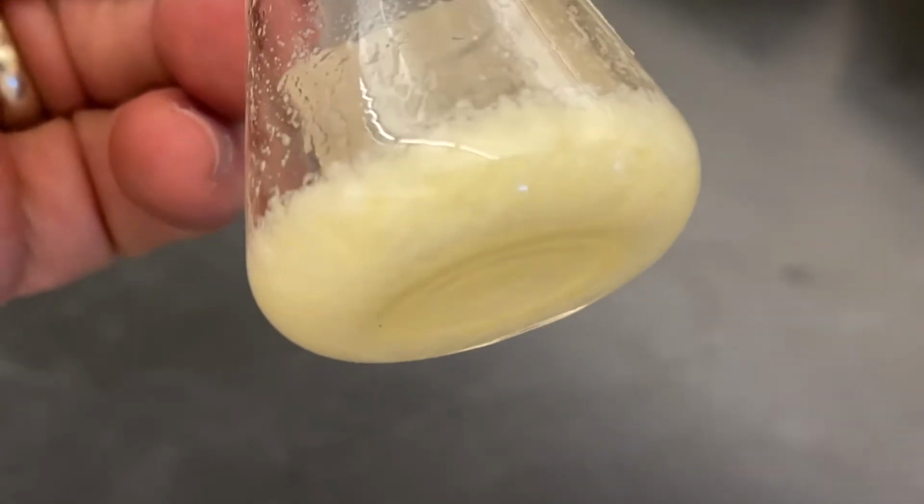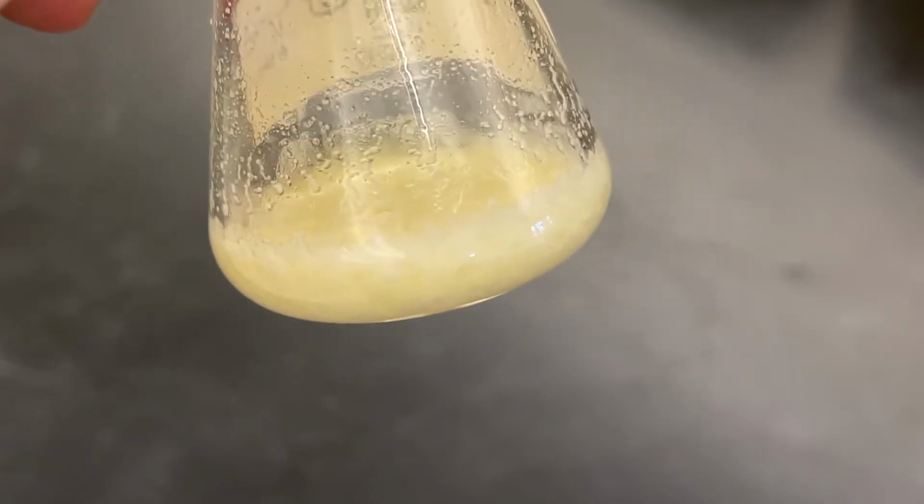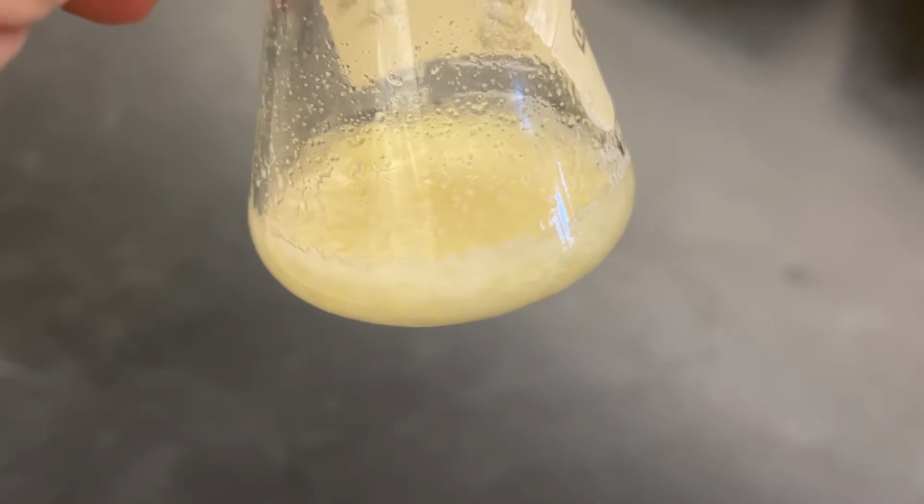It's a 2-day synthesis, and we can see that it's all solid. The idea now is to ice it down and then set up a filtration apparatus, and we'll get it filtered. So that's our next step.